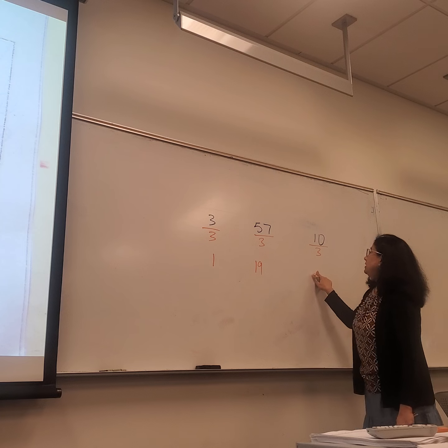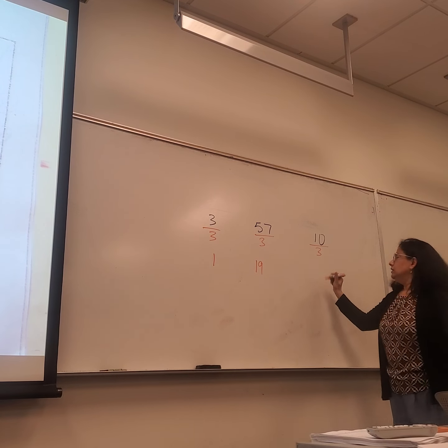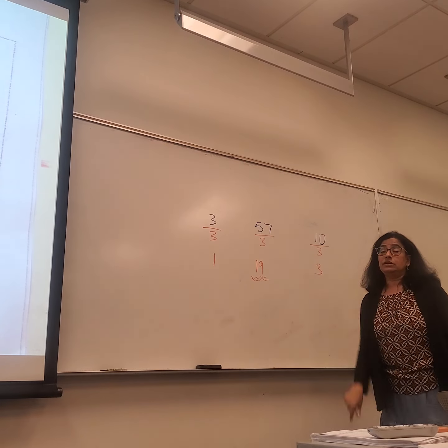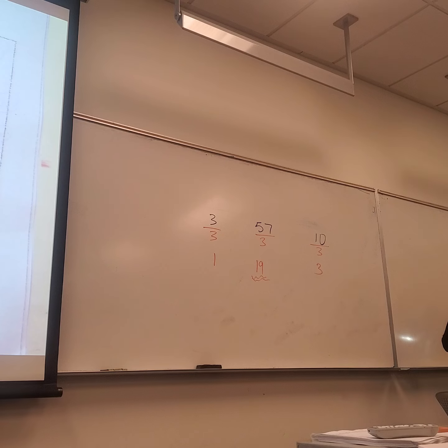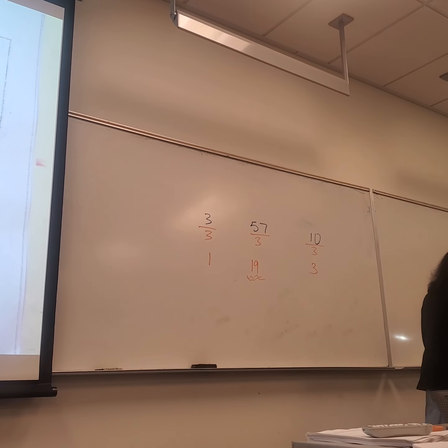And then this would be about 3.3. So let's say 3-ish, about-ish, right? So I think this one we might have to fudge a little bit to fit the chemical formula. You guys with me? Okay. Let's look at multiplicity. What's the multiplicity of this?